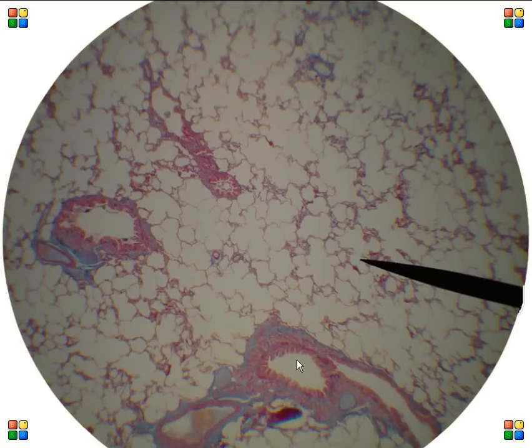and this bronchus, and this little bronchiole. And then we see compartments for blood. Here's a larger blood vessel and another larger blood vessel. I guess let's go on to a higher magnification.